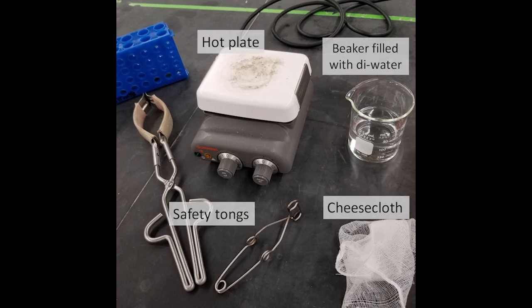To set up your bench for the Nelson-Somogyi method, fill a 250ml beaker halfway with deionized water and obtain a square of single-ply cheesecloth. You should also have a hot plate at your bench space and a few safety tongs available for you to use.